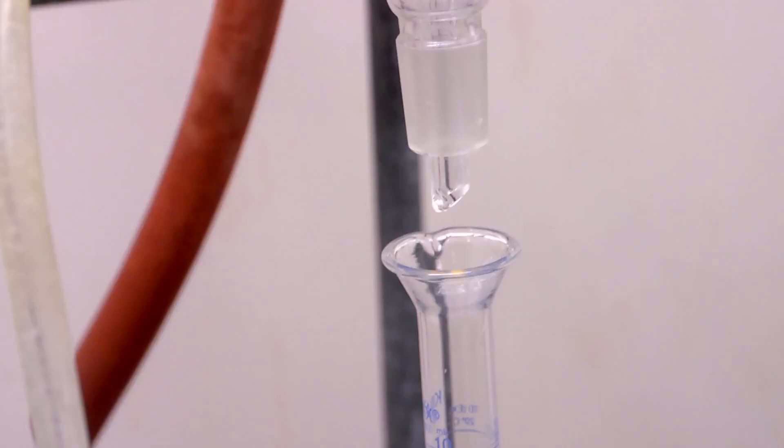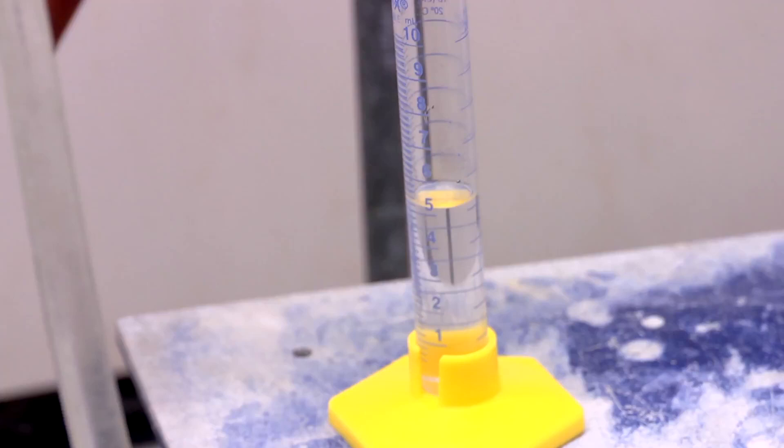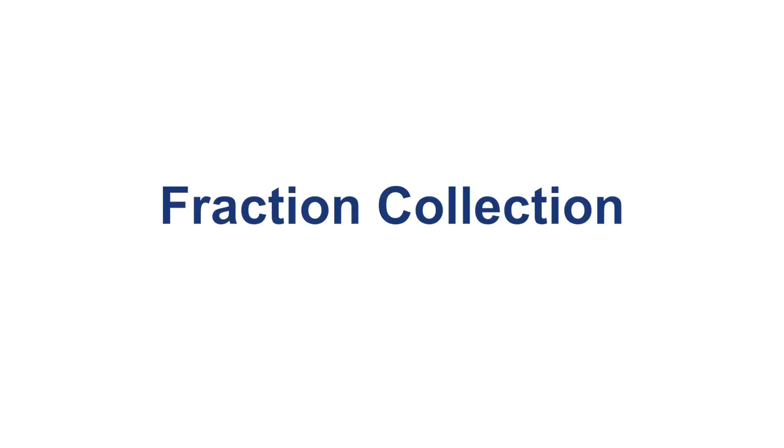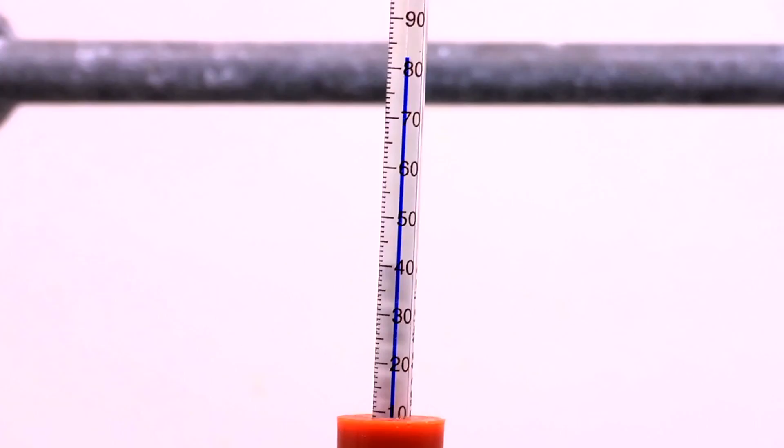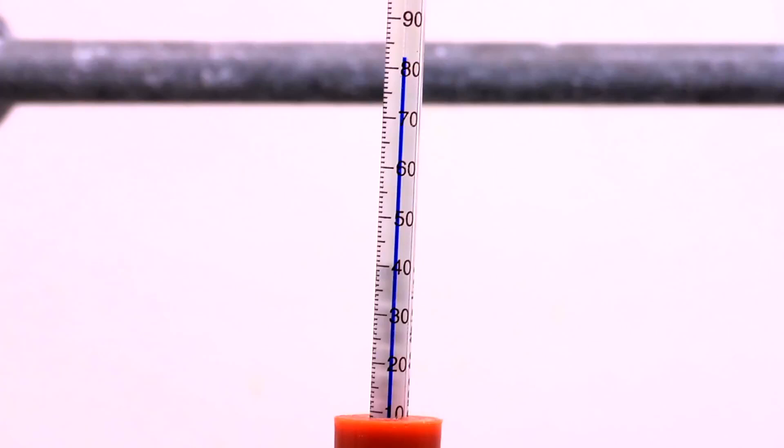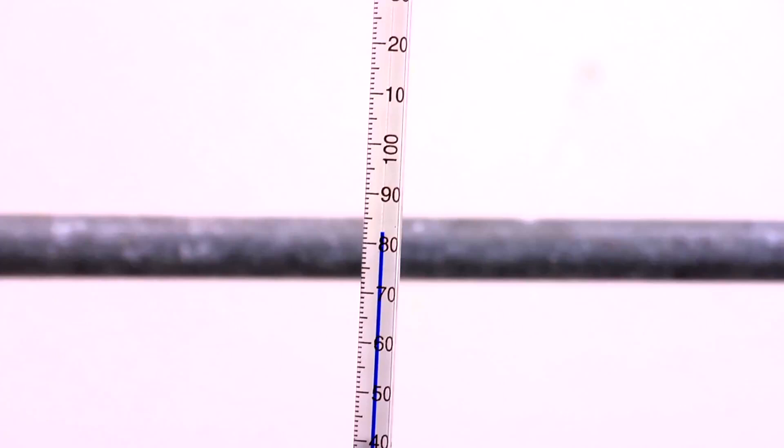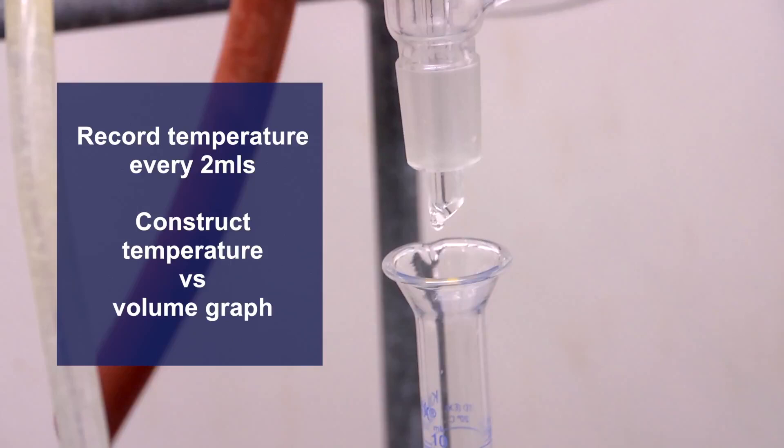Like simple distillation, product purity can increase by heating slower for a longer period of time and by performing subsequent distillations on the collected product. Watch as the temperature rises and condensation appears. Make sure to collect and record the temperature as the first drop of distillate is collected. From then on, you will record the temperature every 2 milliliters.